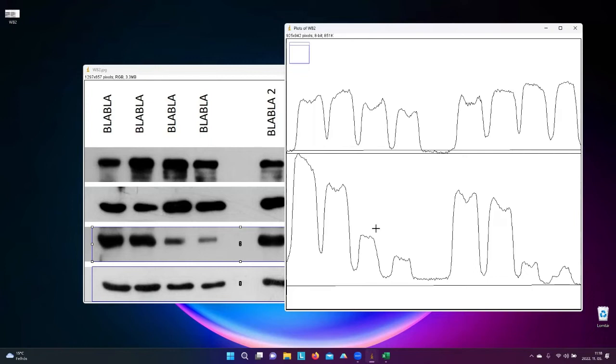And the peak separation can work with the same feature of this program, which means that you need to cut these into the four, or like the other set of samples. What does it mean? For example, here in the case of the GAPDH, as you see, that was the first peak, and this was the second one, and the third one, and the fourth one. So you need to close these peaks with straight lines. And this is how we close the peaks.